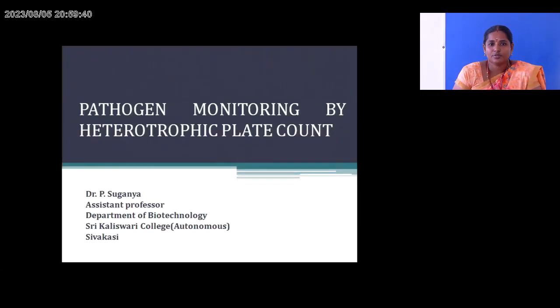Good morning students, today we will discuss pathogen monitoring by heterotrophic plate count.